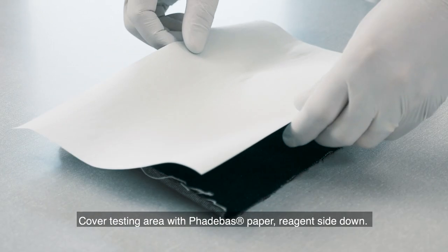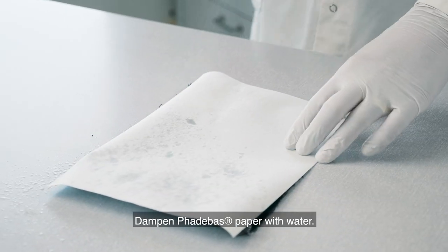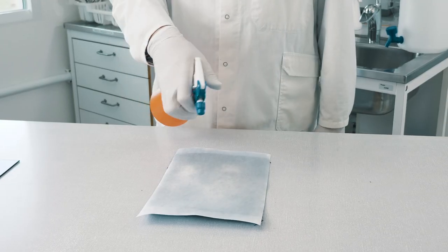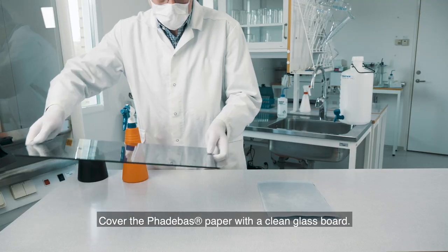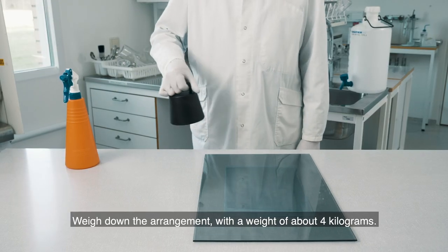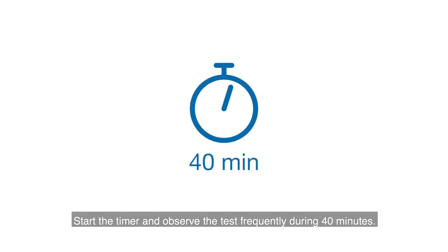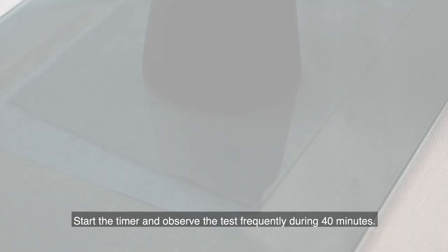Cover the testing area with Fatabass paper, reagent side down. Dampen Fatabass paper with water. Cover the Fatabass paper with a clean glass board. Weigh down the arrangement with a weight of about 4 kg. Start the timer and observe the test frequently during 40 minutes.